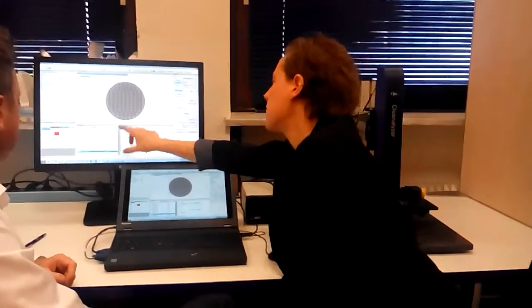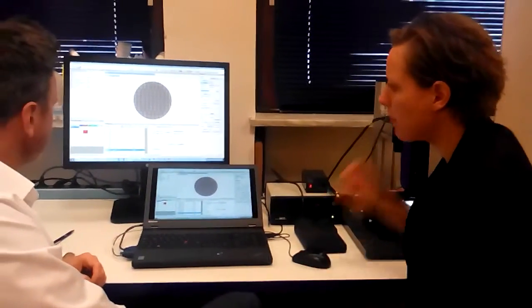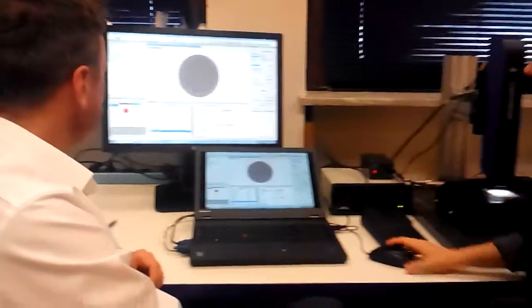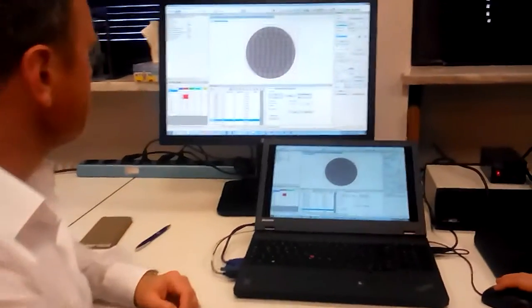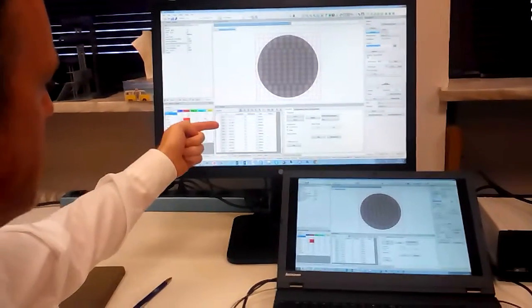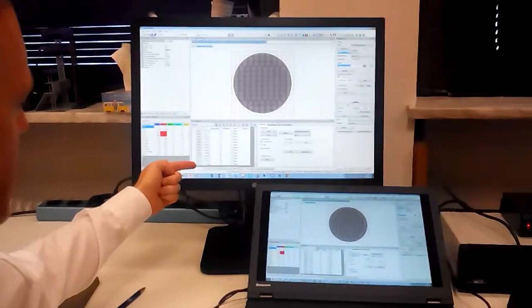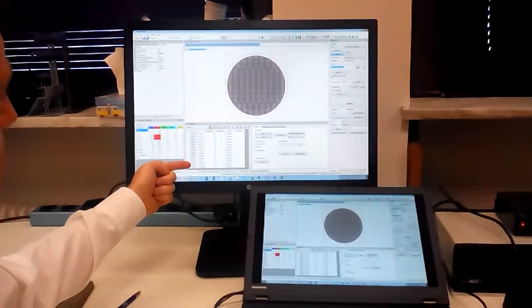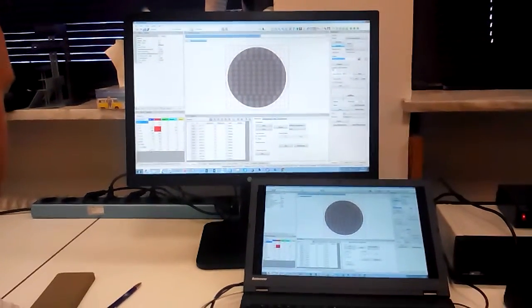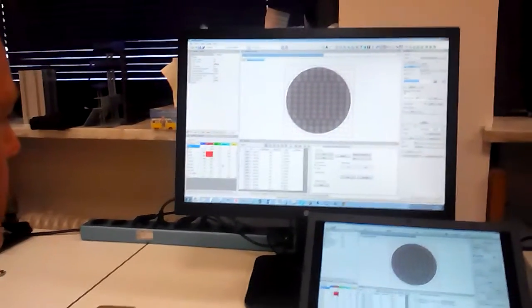Here is the most, let's say, interesting part, because here we can see all metals or all particles that have been detected. So how many particles has it actually counted there? I noticed that every particle has an ID number now, every single one. And you can see 2,513 particles we've counted, is that correct? That is correct. Yeah. You can see it here, and you can see it in this window.